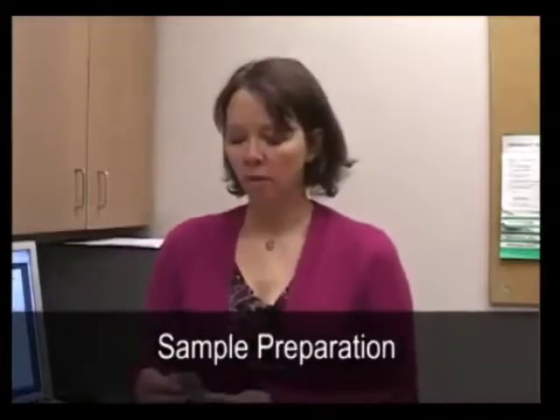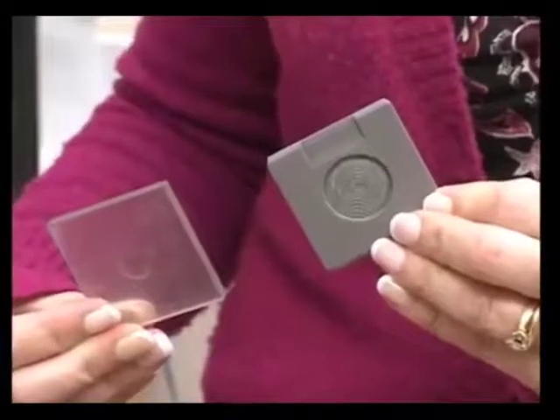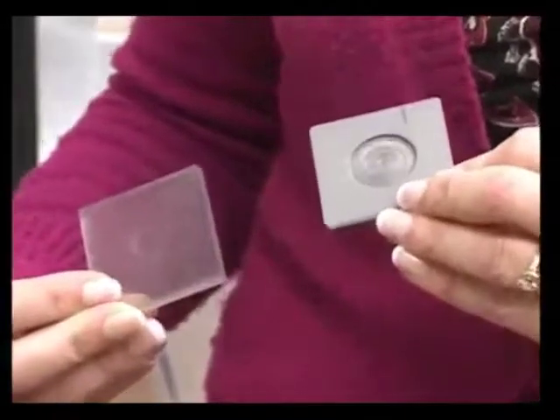For X-ray diffractometry, powder diffraction, it is important to have a well-defined polycrystalline material. And the individual particle sizes of your material should be below 45 microns. You need enough to fill one of these wells, and it should be packed in. What is important is to have individual crystallite planes so that when the beam hits at a particular angle, Bragg's equation is satisfied and you get a peak.